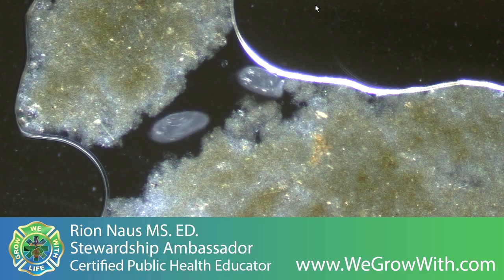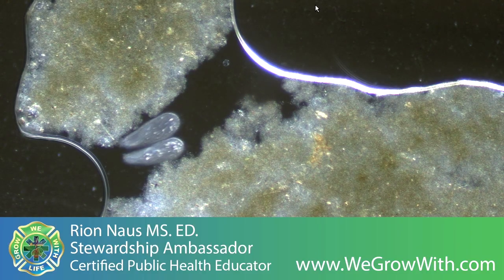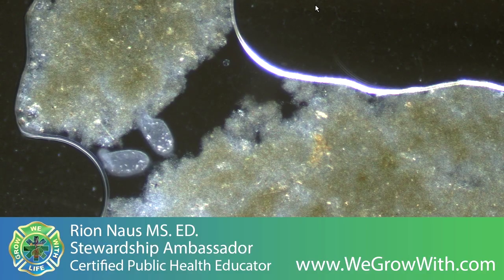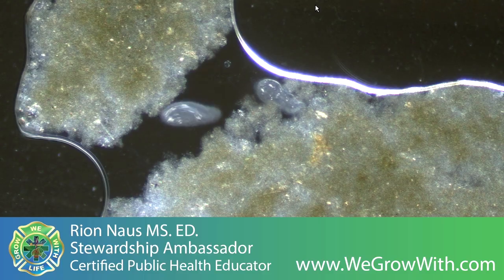So if it cleaves off, then we might see one of those possibly get wrapped up all by itself. Remember, it's resisting that surface tension where everything else is yielding to it.